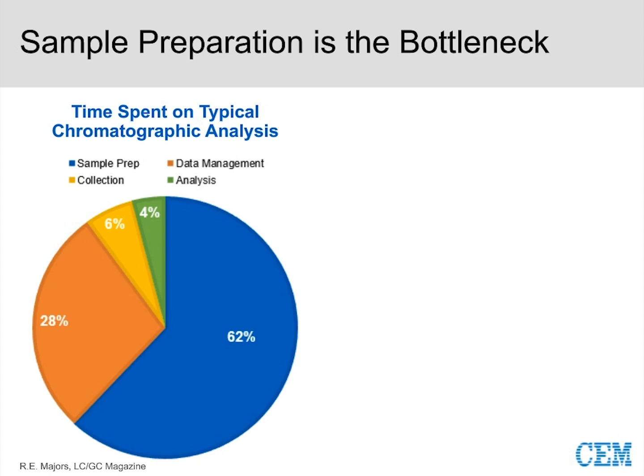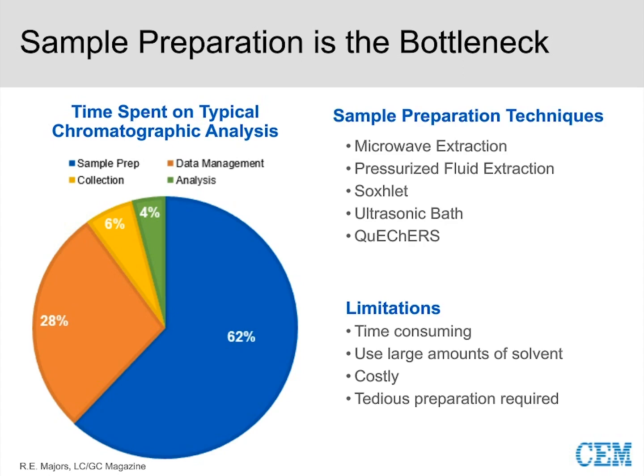I have listed here just a few techniques. It is certainly not exhaustive, and I recognize that all of them may not be very applicable to this topic as a whole, but this is some of the big sectors we're doing in sample preparation today. And if you look at it, Soxhlet stands out to me. That's a technique that has been around for 125 years. And you're seeing it so much in today's labs. So there's just an opportunity, I think, to modernize the sector of sample preparation as a whole. And I really feel that the EDGE does that. But I recognize that for this talk, the applicable technique we're talking about is QuEChERS.